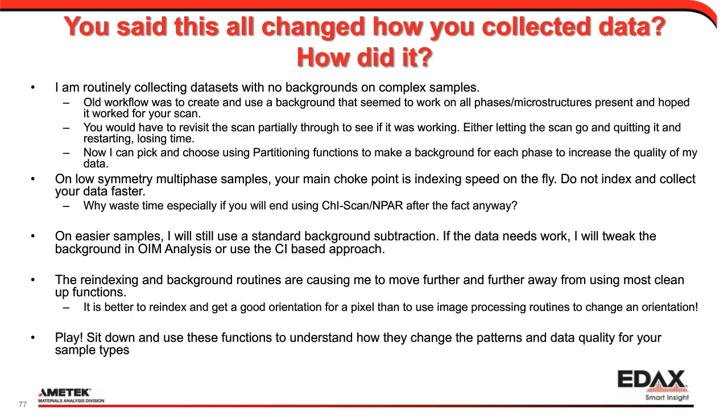So again, how does it change how I collect my data sets? On complex samples, I'm now routinely not collecting with any background, or just a static background to start off with. My old workflow was to create a background that seemed to work for everything at the same time and hope it held true for my entire run. I would usually revisit my scan partway through to see if it was working as expected, and either let the scan go or quit and restart it, losing time.